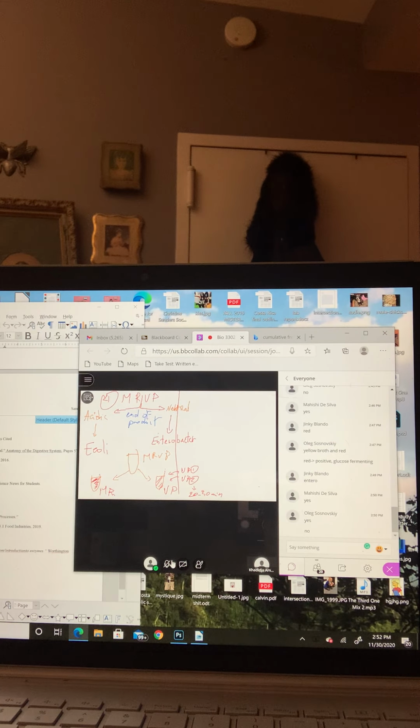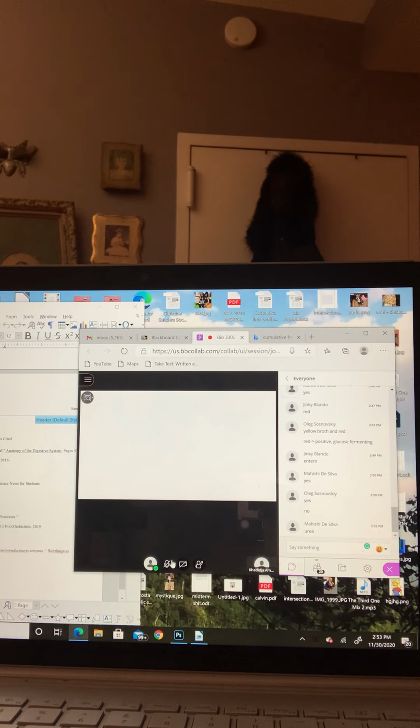Just to make sure. So we did the TSI, MRVP, SIM test, indole. What else? The urea. Good. So the urease test.